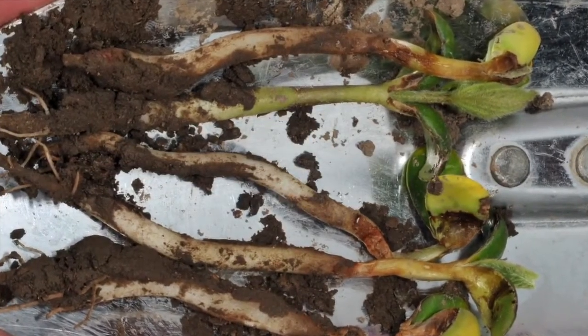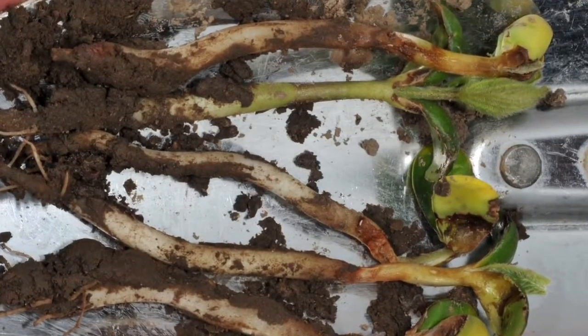Diseases are very hard to distinguish based on the symptoms, and you need to submit samples to tell if it's a disease issue versus herbicide injury or just too much moisture. So Gail's going to show us today how to submit a proper sample to the Plant and Pest Diagnostic Lab so we can give you an accurate result about what is impacting your soybean stand.